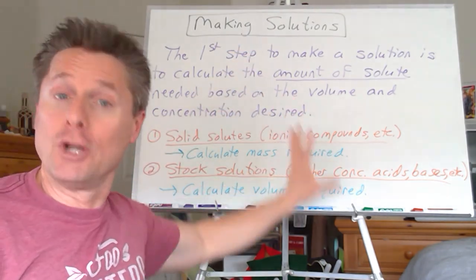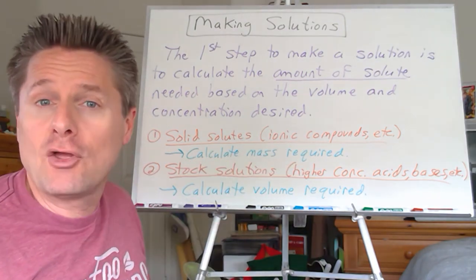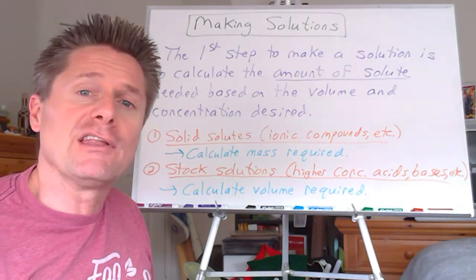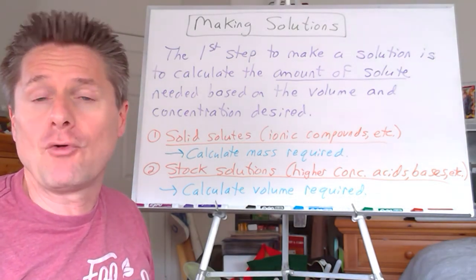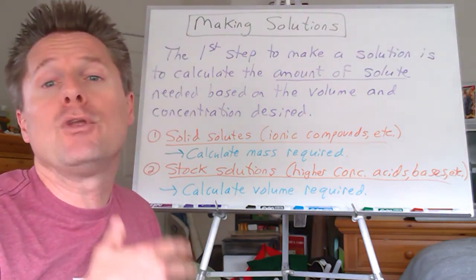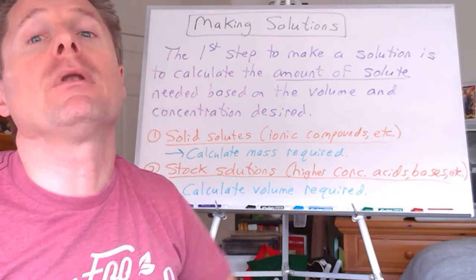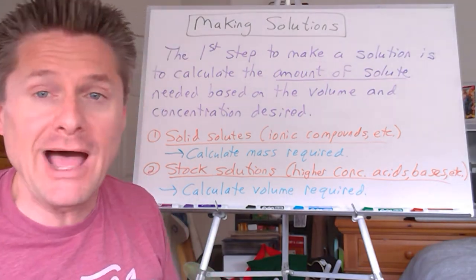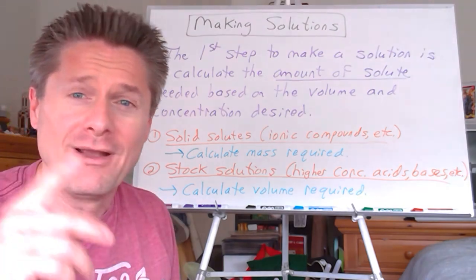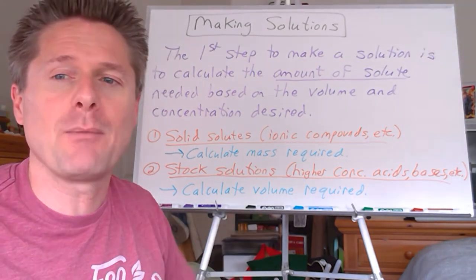Now that we know what we're looking for and how to recognize it, let's do one example for solid solutes, one example for stock solutions or higher concentrated solutions of that same species you're looking for. Couple examples, you're good to go for step one. So now when you go to lab, you will learn how to properly prepare that solution without accidentally contaminating it or diluting it by adding too much water. That's one of the biggest mistakes I see, and that requires a whole separate video. Let's do some sample calculations.